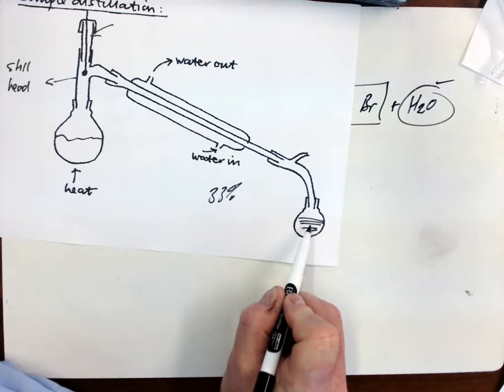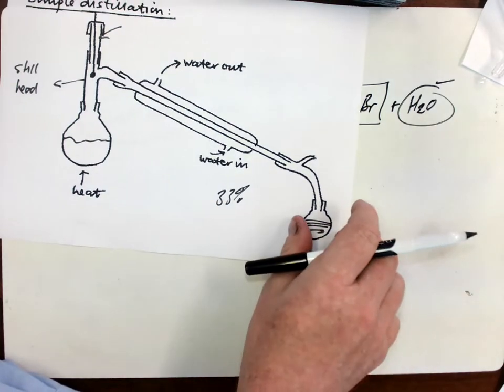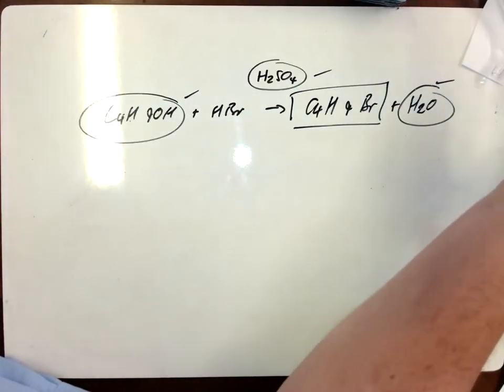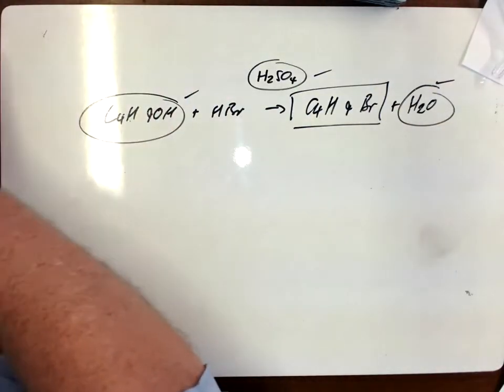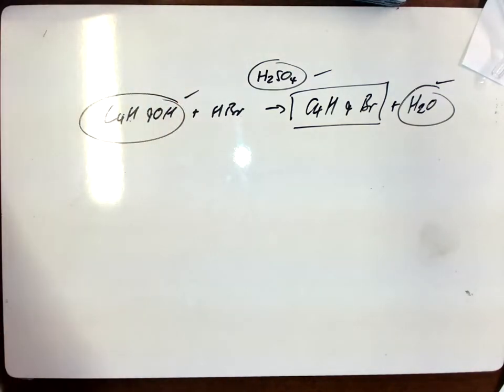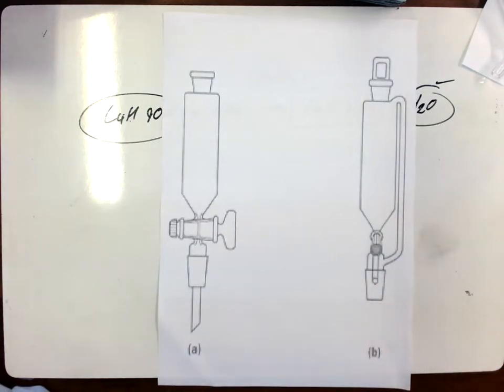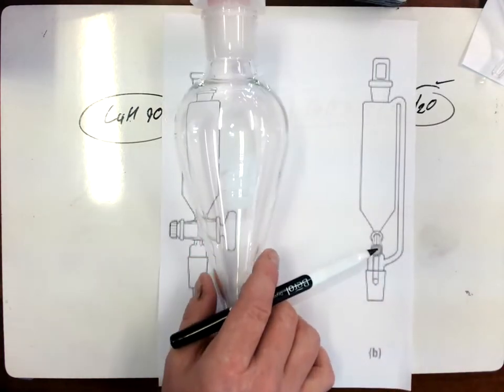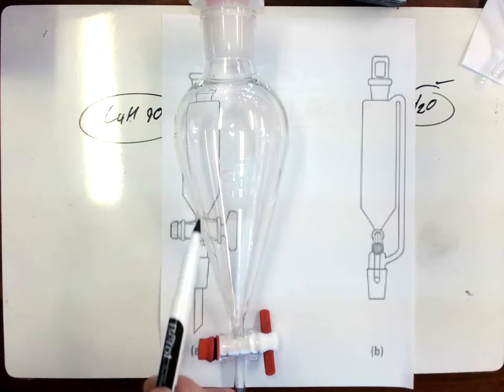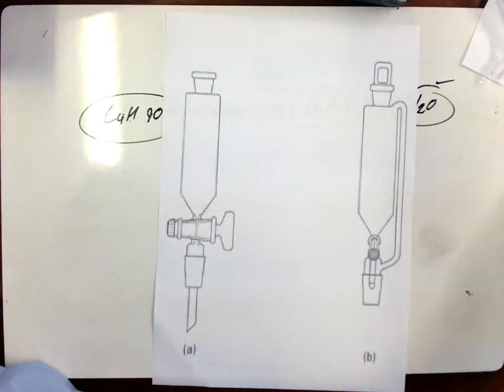And we've now got to take this slightly purified product and start to purify it even further. So the first thing that we do is we will take our product and simply transfer it this time into one of these, back into a tap funnel or a separating funnel, if you can just about see that. And we will give it a really, really good shake up with some water.